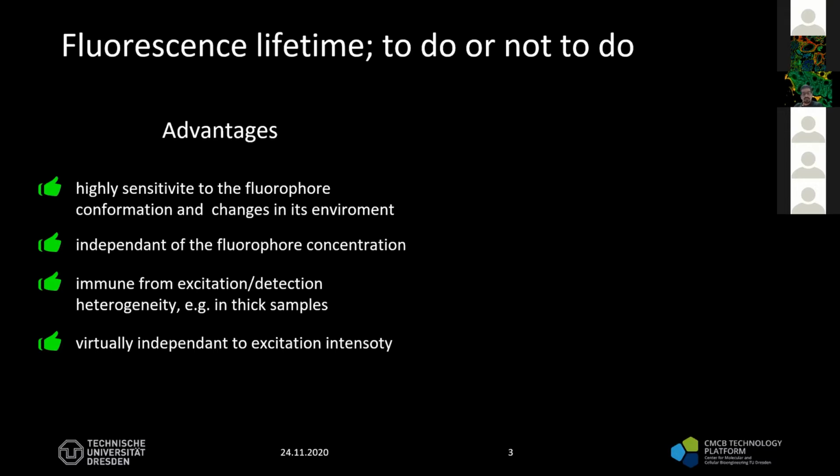The other advantage is that it's, in some cases, in principle independent. I'm not saying that the decay that we are going to analyze at the end is independent from the concentration, but in principle, the lifetime measurement, the lifetime of the fluorophore, is independent from the concentration that we have inside the cell. So that's a very important point that we have to keep in mind.